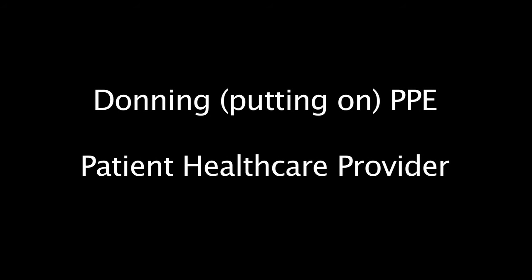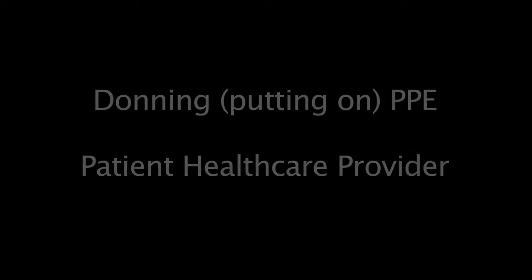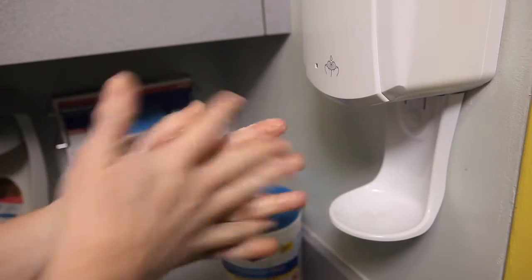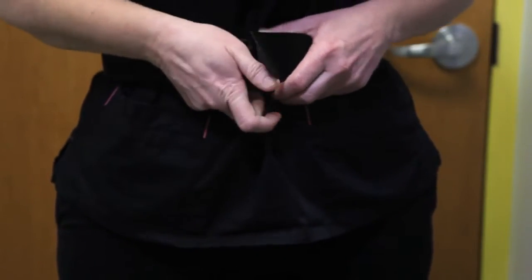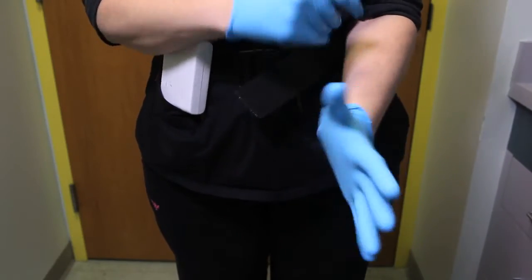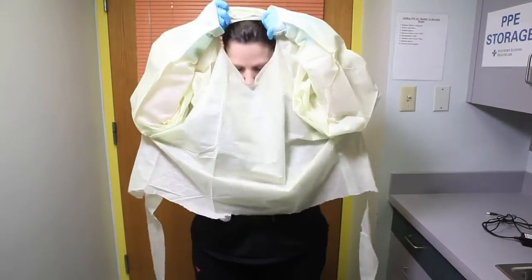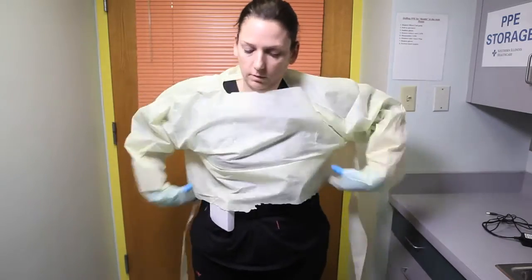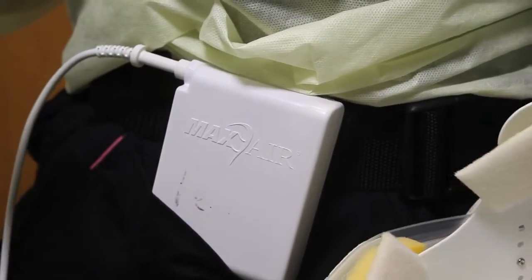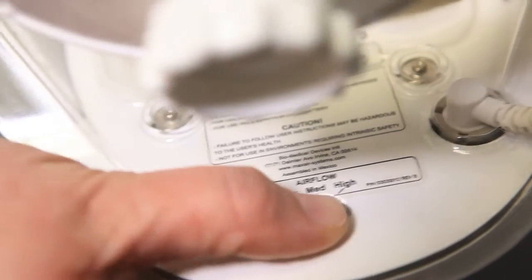Donning — putting on PPE — for the patient health care provider. Perform hand hygiene. Don capper belt. Attach battery to capper belt. Don regular gloves. Don isolation gown. Make sure thumbs are in thumb holes. Plug capper into the battery. Be sure the battery is charged and place the setting on high for comfort.